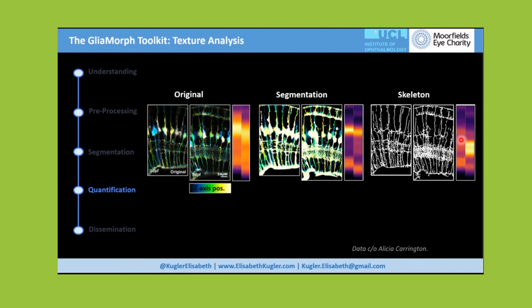And particularly if we look here in this IPL, what you can now appreciate is really that the amount of skeleton at 5 days really significantly increased, and we can actually see these 2 different bands, which is again in line with what we know biologically. And again, you could do this for other measurements as well, just doing the top to the bottom plotting approach.